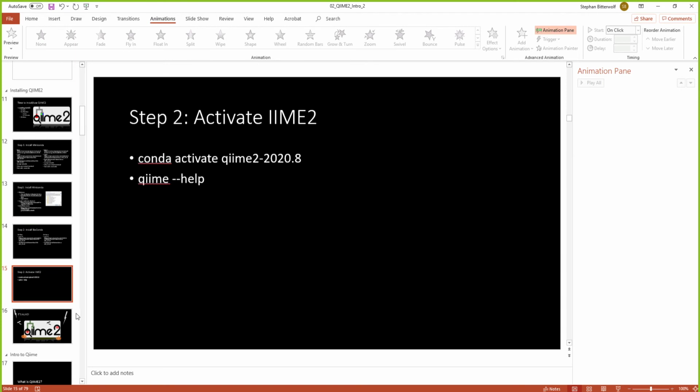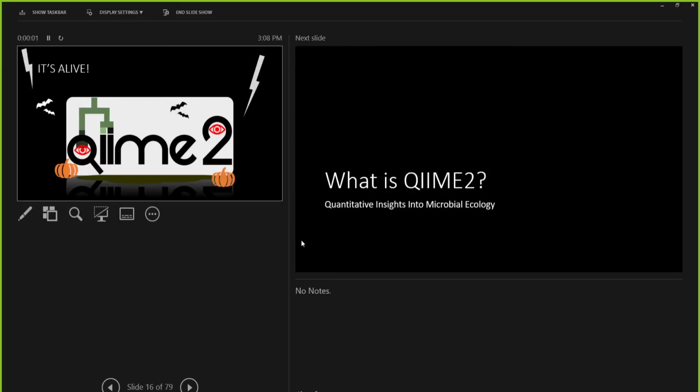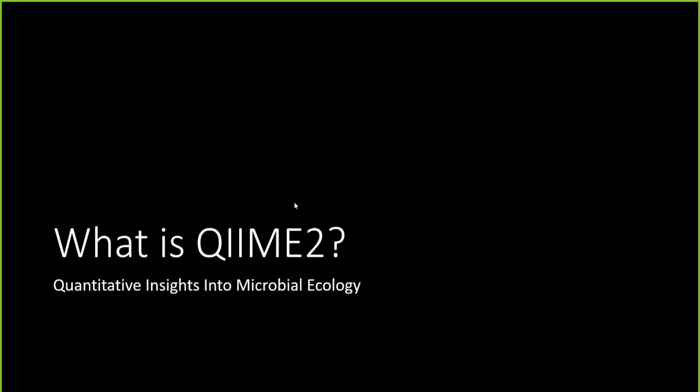For the most part, it looks like a lot of us got QIIME to go. So here's my "It's Alive" slide. And of course, you're probably asking yourself, what the heck is QIIME2? QIIME2 stands for Quantitative Insights into Microbial Ecology.